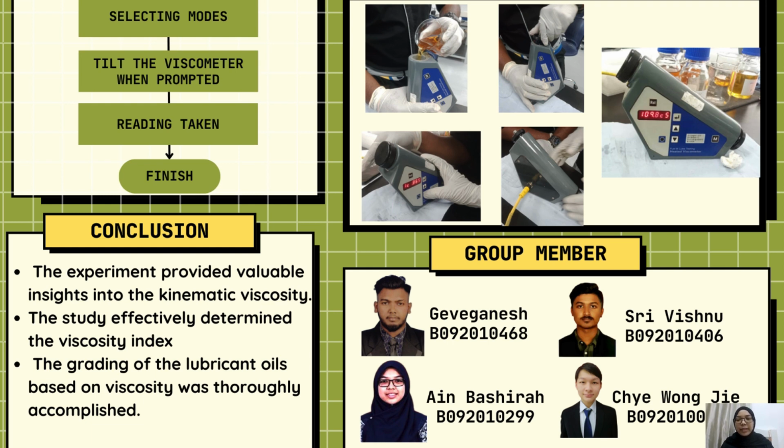Lastly, the grading of the lubricant oil based on viscosity was accomplished. Sample A was classified as SAE 30, indicating a lower viscosity at higher temperature, making it suitable for applications requiring quicker fluid flow. Sample B, with an SAE grade of 40, suggests a higher viscosity at elevated temperature, so it is suitable for applications where a thicker lubricant is beneficial.